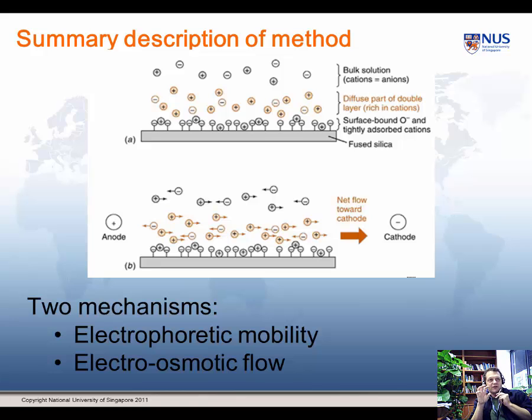So from the wall you have the oxide ions sticking out into the inner diameter, and they are of course negatively charged. So if we think of this as a sort of graph, and we're going to move out from the side of the tube, immediately on the side of the tube you have a layer of negative charge.